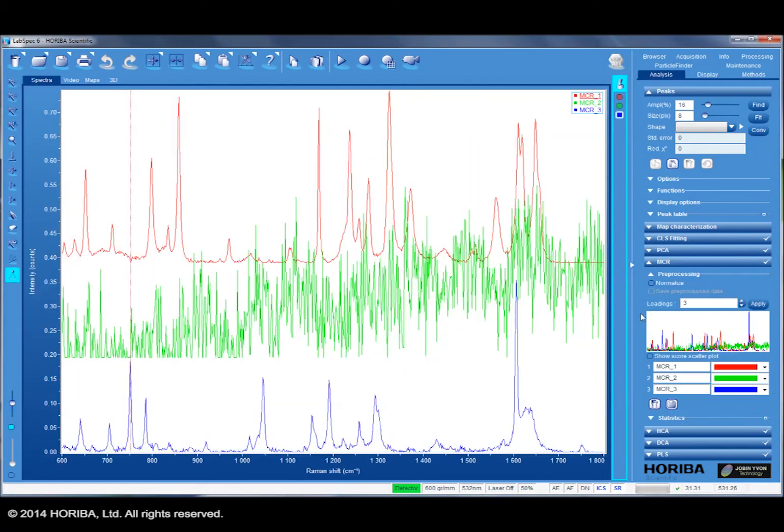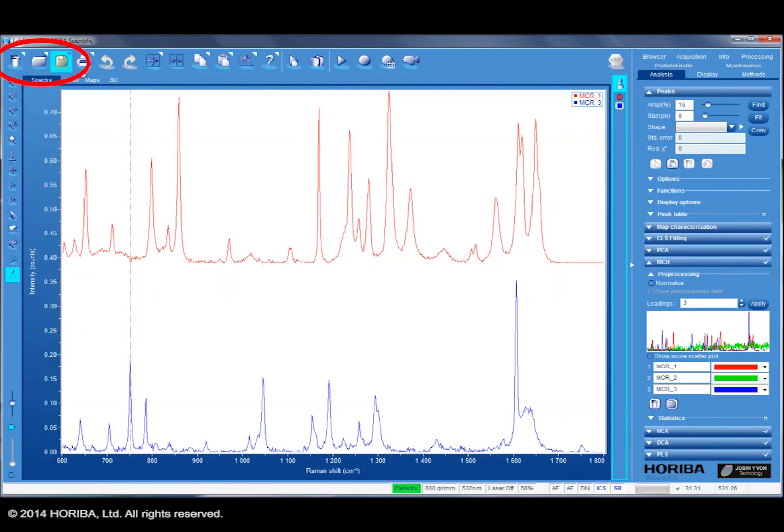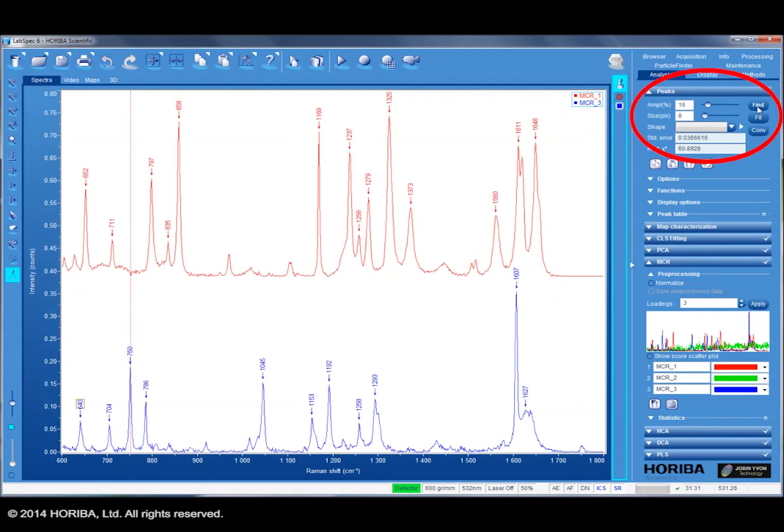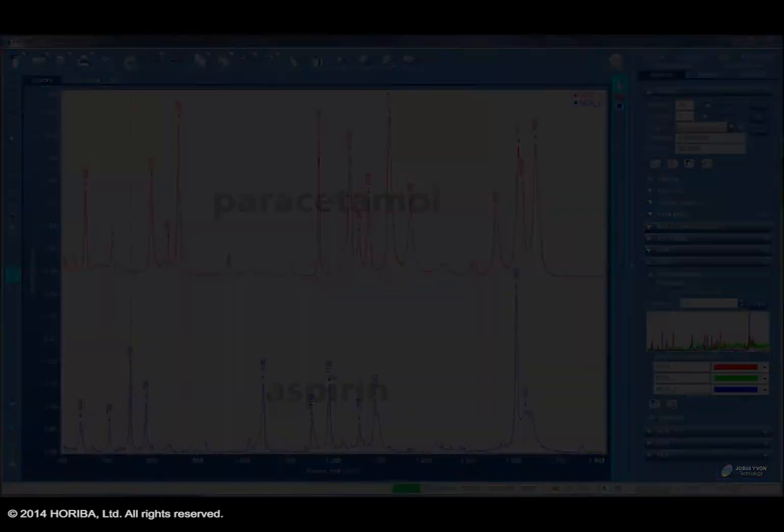The average spectra can be viewed. In this case, the contaminant spectrum is removed since this is of no interest, and then peak labeling can be performed. The two spectra correspond to aspirin in blue and paracetamol in red.